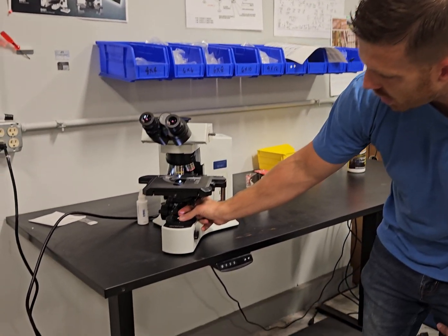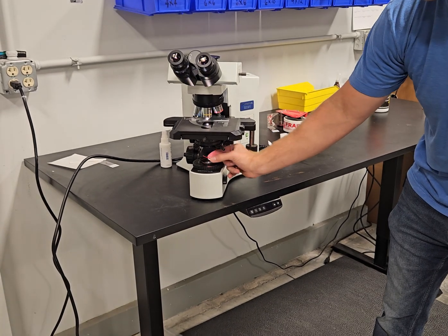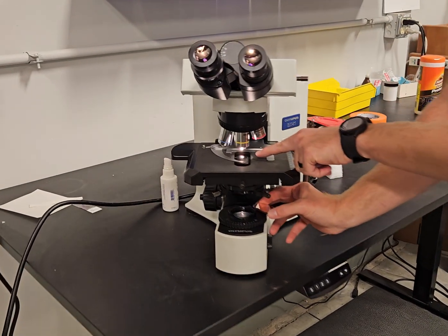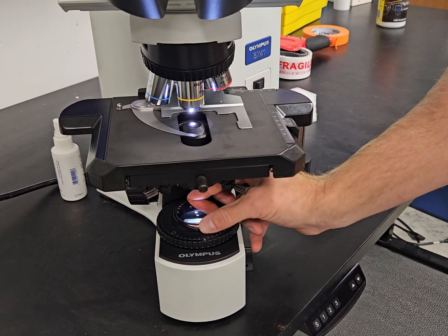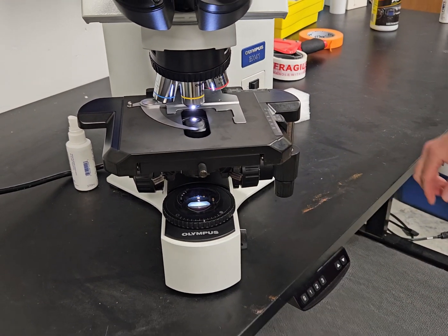It goes right above the dust glass. If you notice, the light color changes to a more cool white/blue color whenever you add that.